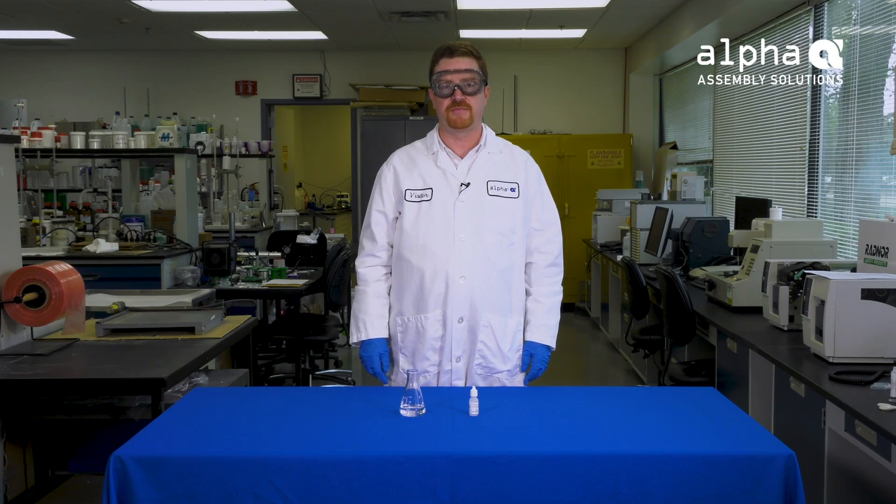In the next step, we add two to four drops of phenolphthalein solution to the Erlenmeyer flask and swirl.